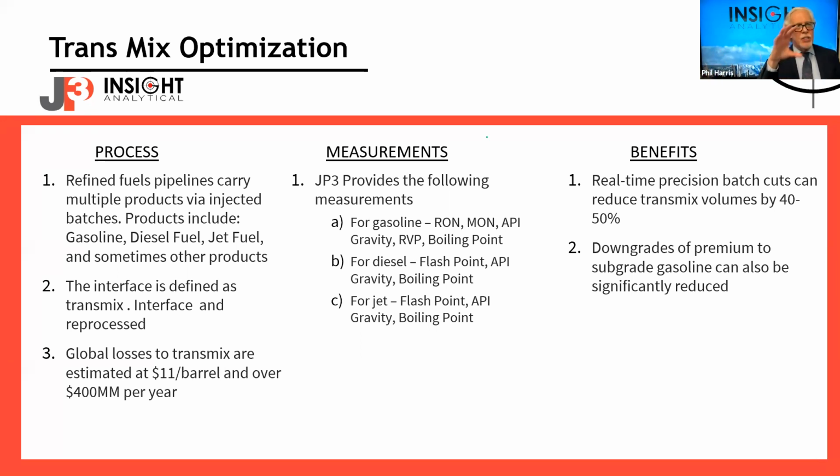Again, people might still use the traditional lab analyzer to monitor how their process is going on a periodic basis, but they go, this gives me my control signals. If you look at a refinery, they'll often have an infrared analyzer to do RVP of gasoline, and because it's fast, they can blend, and then they'll have other methods for saying, but I'll check it every once in a while against something else.